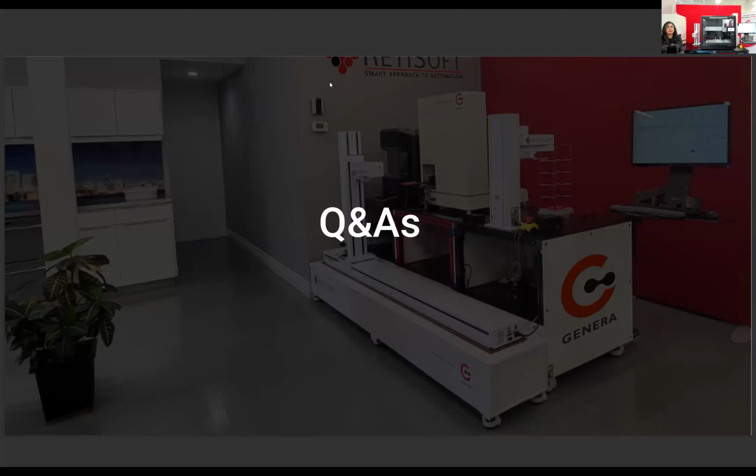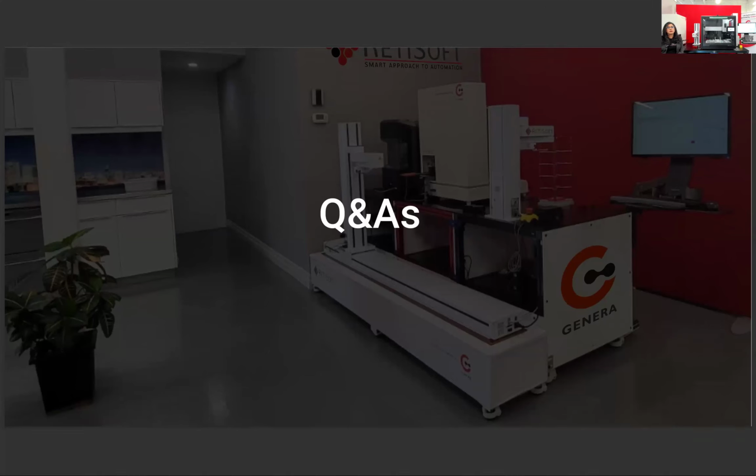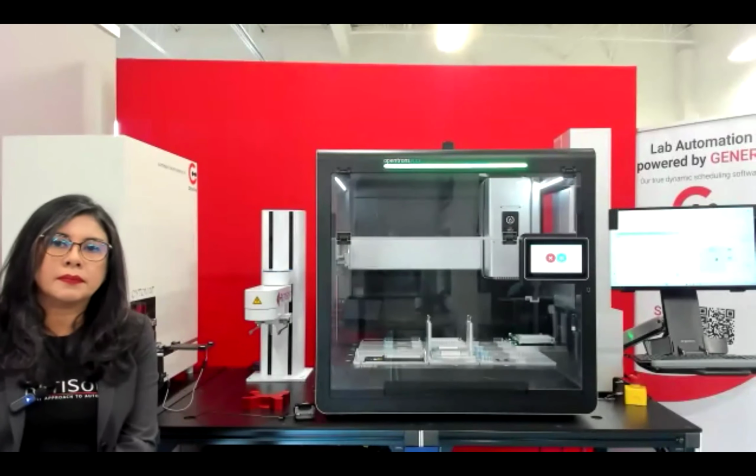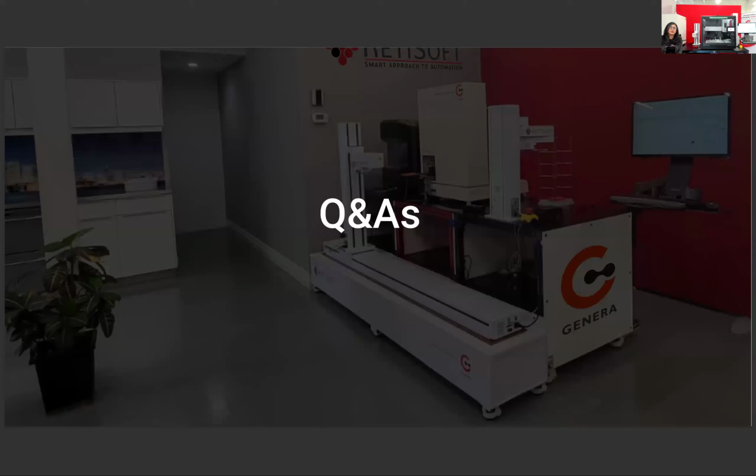Igor? Yes, you can. Let me stop sharing this screen and share my Genera screen, and I could show you how that could be done.